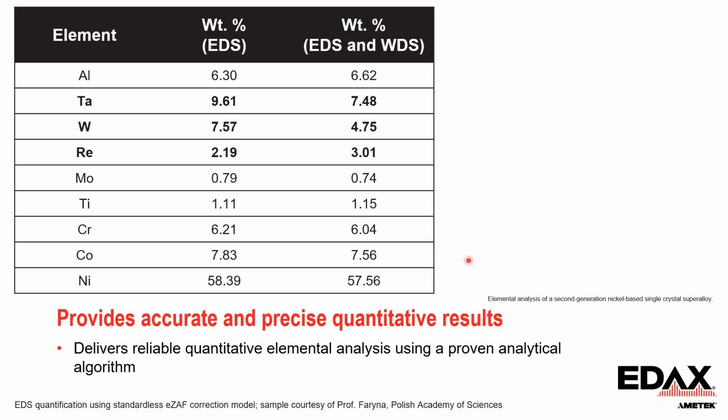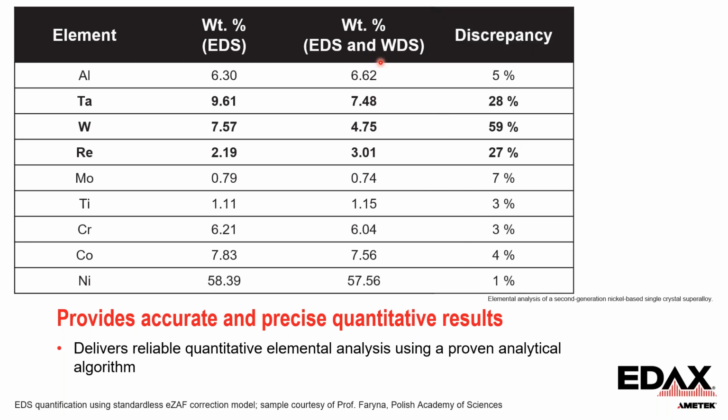These are the quant results of a superalloy. This column is EDS results, and this column is combined EDS and WDS quant results.